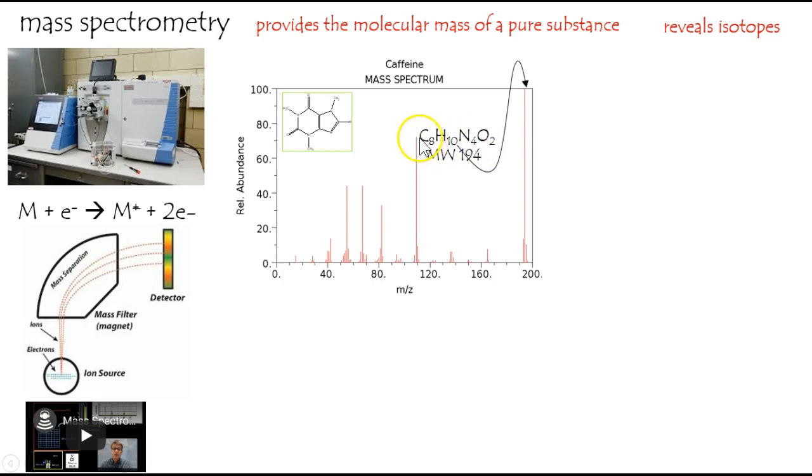C8H10N4O2. This would probably come from elemental analysis. So first you get its 194. Then in this particular case, if you did elemental analysis, I think you'd get C4H5N2O1. That would be called its empirical formula. Getting the molecular weight is key to turning that ratio of elements into their true ratio for the molecule, and you'd have to double it. And there's your molecular weight, fine.